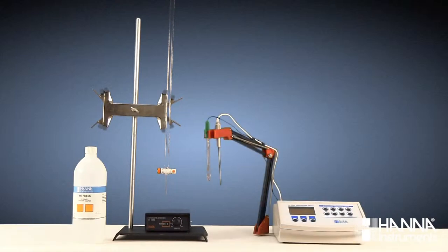A pH meter, such as our HI-3222 research grade meter; a pH electrode, such as our HI-1131B; an automatic temperature compensation probe; and a color indicator. Today we'll be using phenolphthalein, which changes from colorless to pale pink at a pH of approximately 8.2.